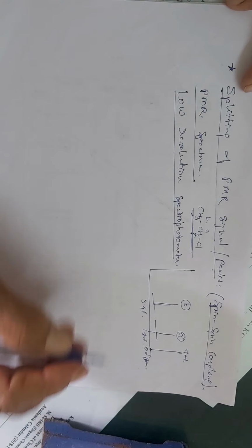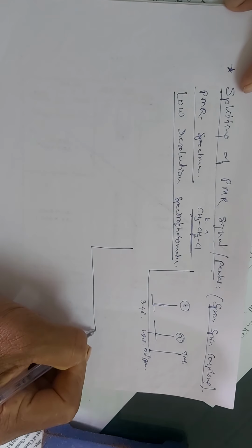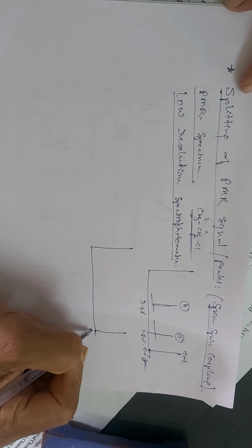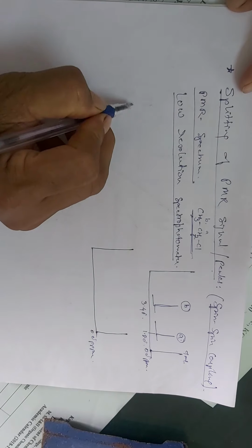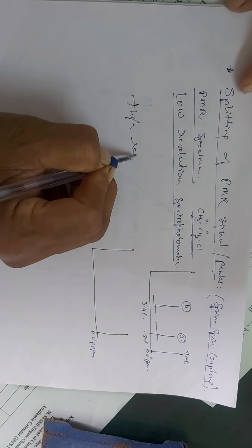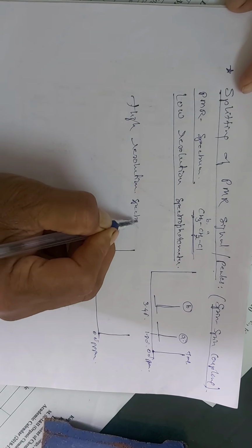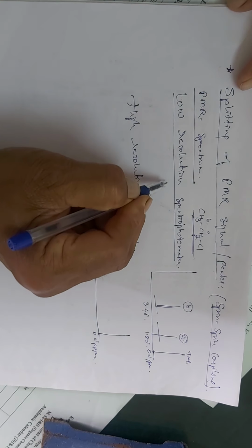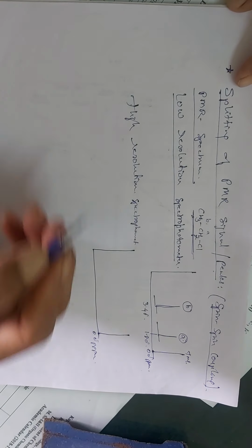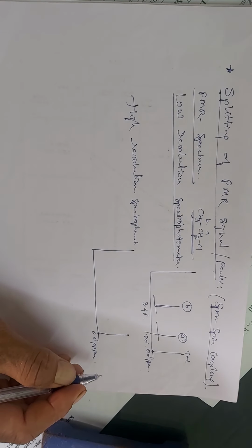But if the spectrum is taken under a high resolution spectrophotometer, what are we going to get? What is the resolution? It may be 60, 100 or 200 megahertz, and this may be taken at 300 and 400 megahertz instruments. When you change the instrument, you will get different signals.